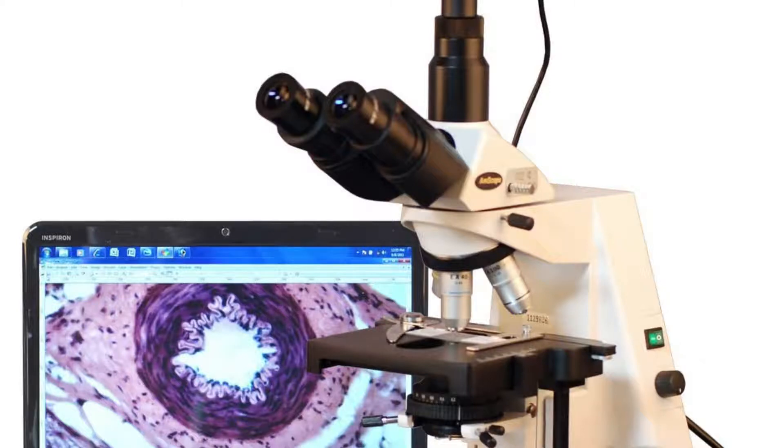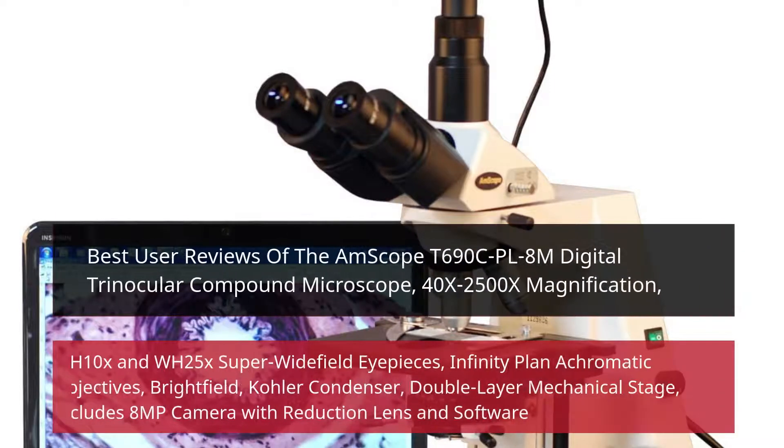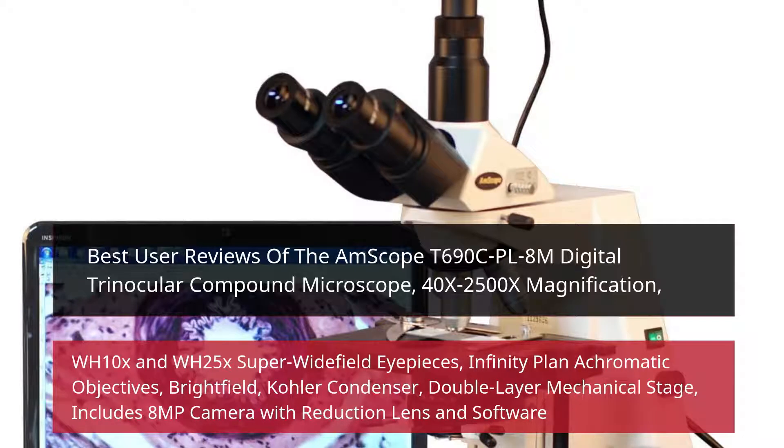Best User Reviews of the AmScope T690C-PL-8M Digital Trinocular Compound Microscope. Features include 40x–2500x magnification, WH-10x and WH-25x Super Widefield Eyepieces, Infinity Plan Achromatic Objectives, Brightfield, Kohler Condenser, Double Layer Mechanical Stage, and includes an 8MP camera with reduction lens and software.